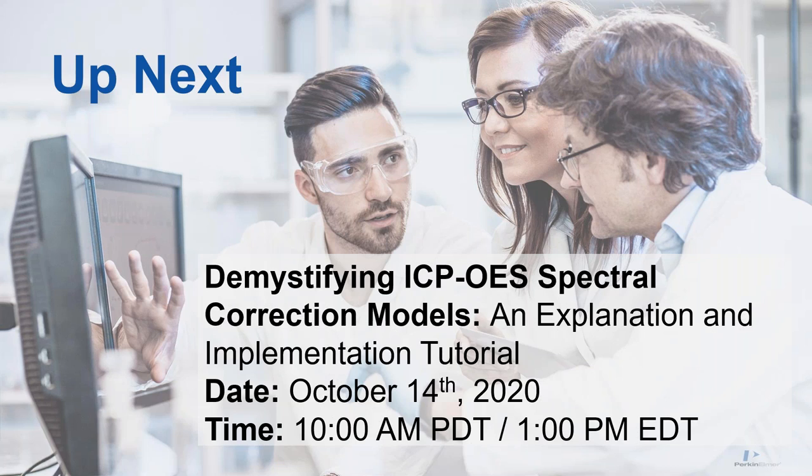I prefer pure standards personally. Sometimes, if you have a pure metal, it's tough to get it pure. Also, get a pure single element standard that's high enough, right? The other thing is when you get a single element standard, you get a certificate of analysis that comes with it, so you can see the concentrations of any contaminants in there. True. Well, if you're using a pure metal standard, it may be 5-9 pure, but you don't know what the other stuff is in there.